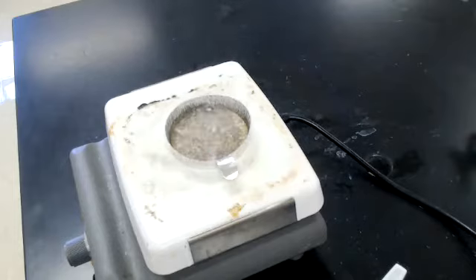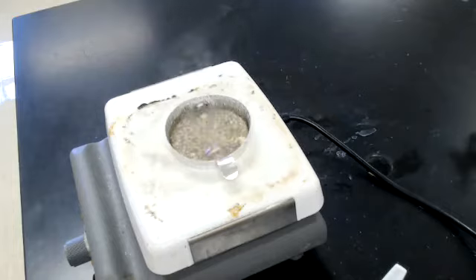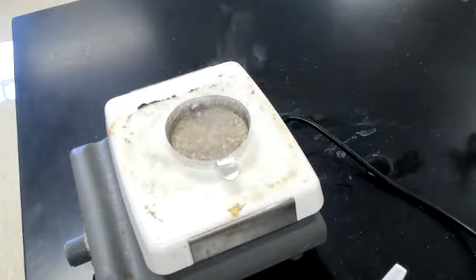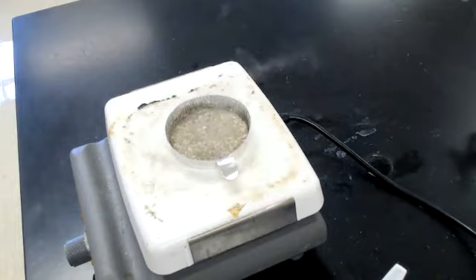So we call it an evaporating dish because we're actually forcing the water to evaporate very quickly. That's the point, to speed up the evaporation rate by putting it on a hot plate. But if I was willing to wait, I could have just left this on the counter and let it evaporate normally. That would have worked. It just would have taken a whole lot more time. So we're going to just let this evaporate.